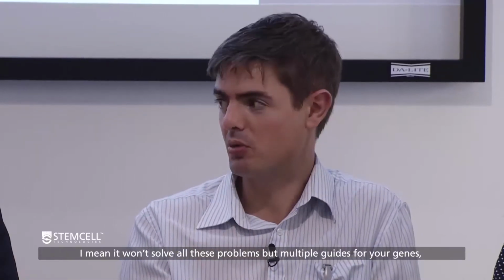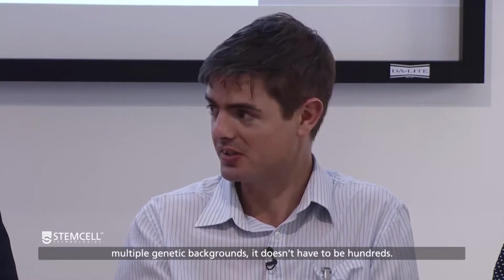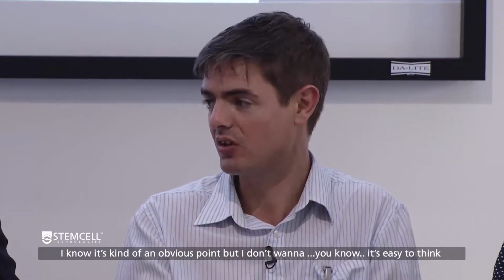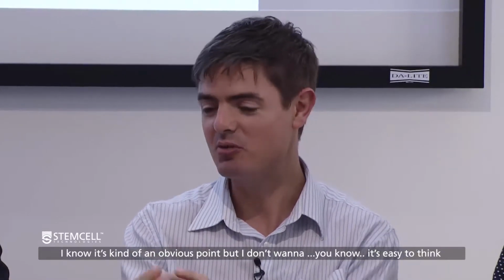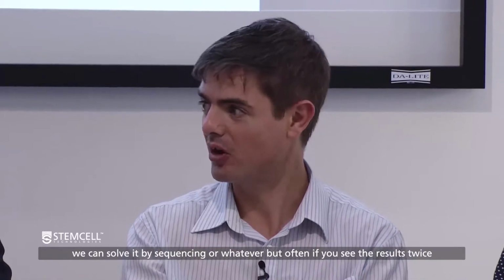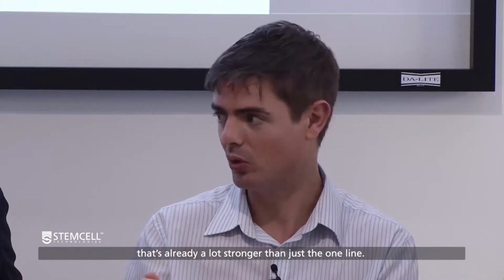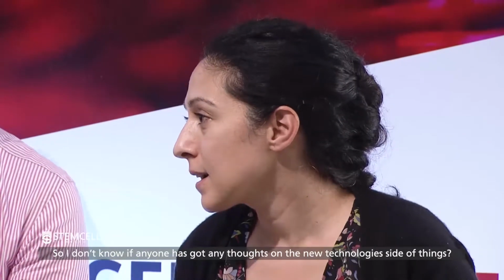It won't solve all these problems, but multiple guides for your gene, multiple genetic backgrounds, it doesn't have to be hundreds. Even one more than the one you're doing will add a lot, I think, in terms of robustness of results. I know that's kind of an obvious point, but it's easy to think we could solve it by sequencing or whatever, but often if you see the result twice in two different genetic backgrounds with two different guide RNAs, that's already a lot stronger than just the one line. So I don't know if anyone's got any thoughts on the new technologies.